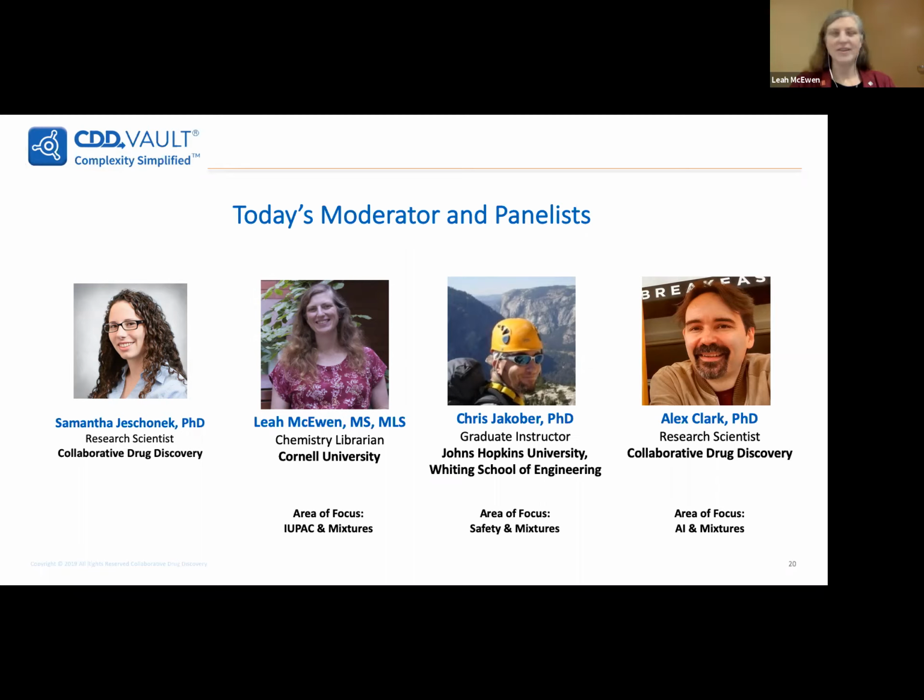Even though reactions are something that you're running in your lab, when we think about them informationally, and particularly when we're designing, we think about reactions conceptually as well, really as transformations, back at the level of single molecules and what we're trying to do with those on a design level. Mixtures are much more about designing things that you're going to use in the context of your laboratory, that real world aspect.